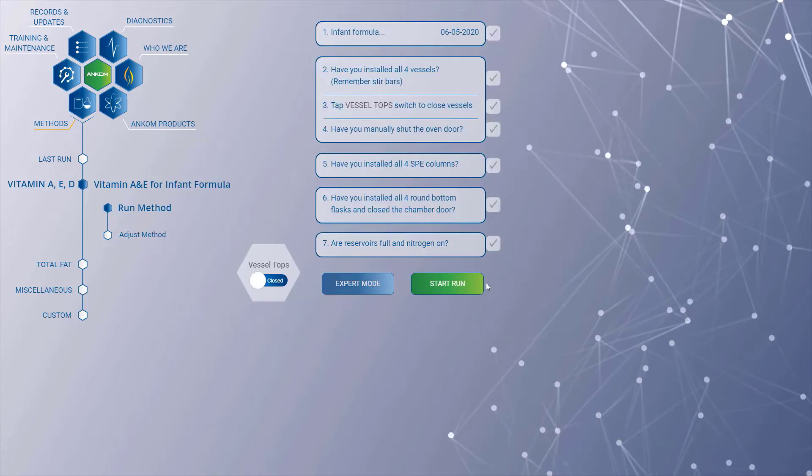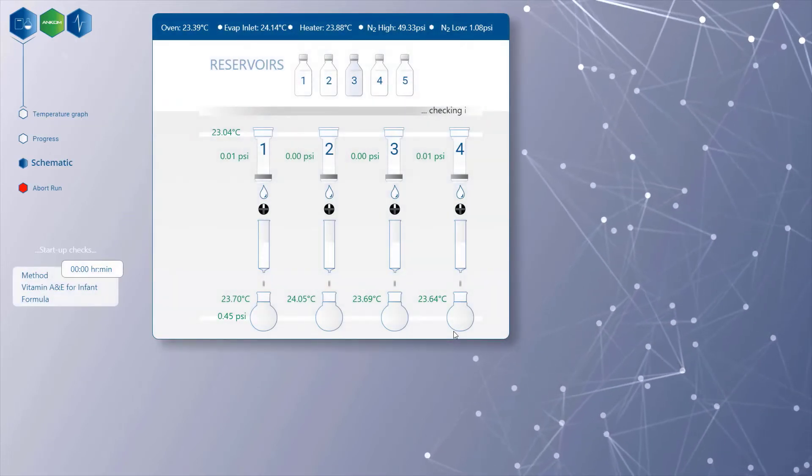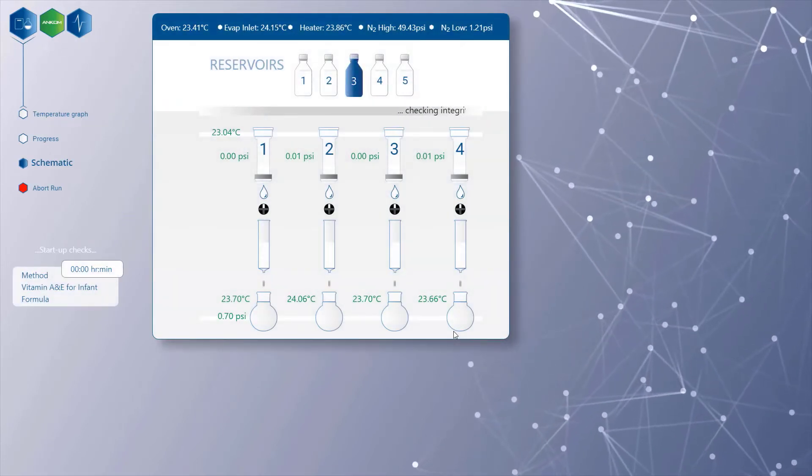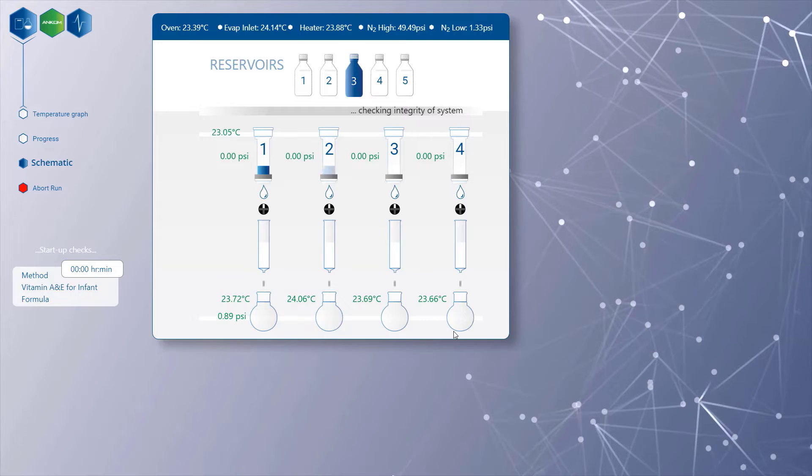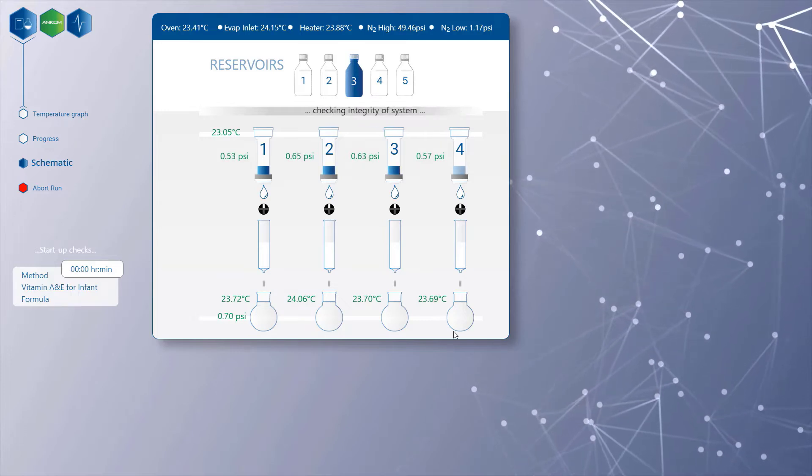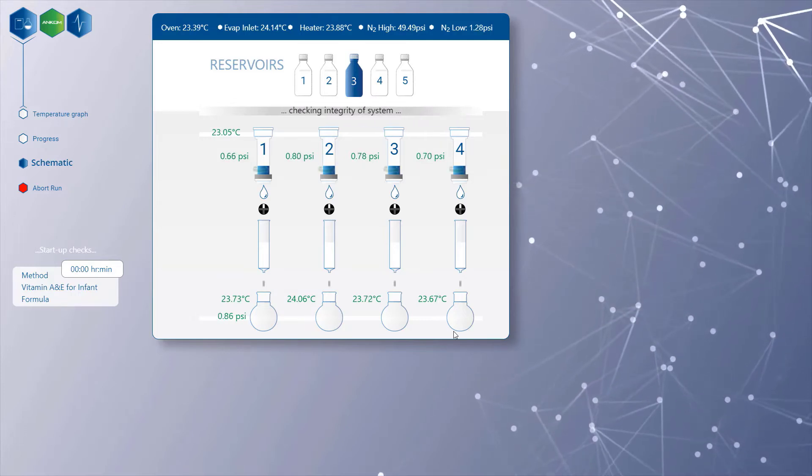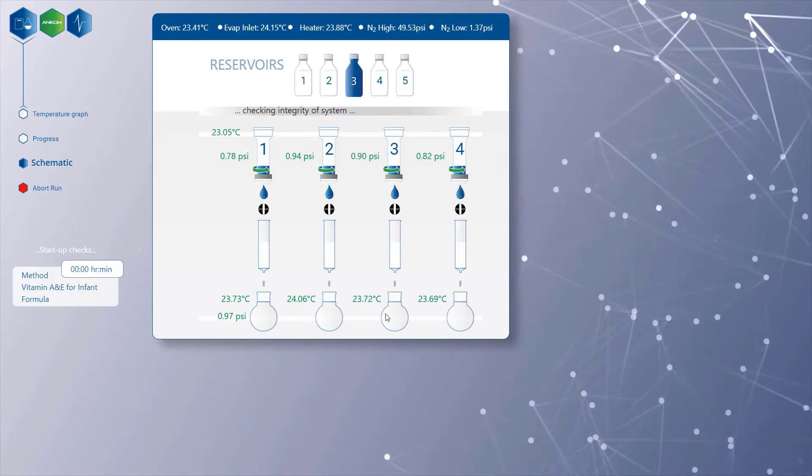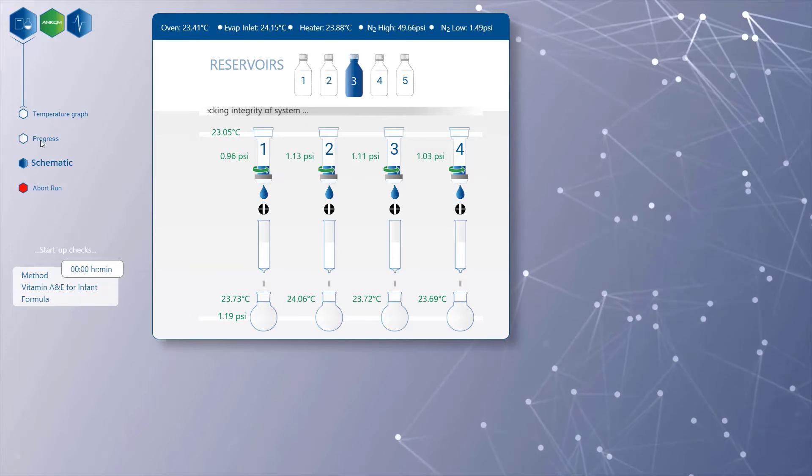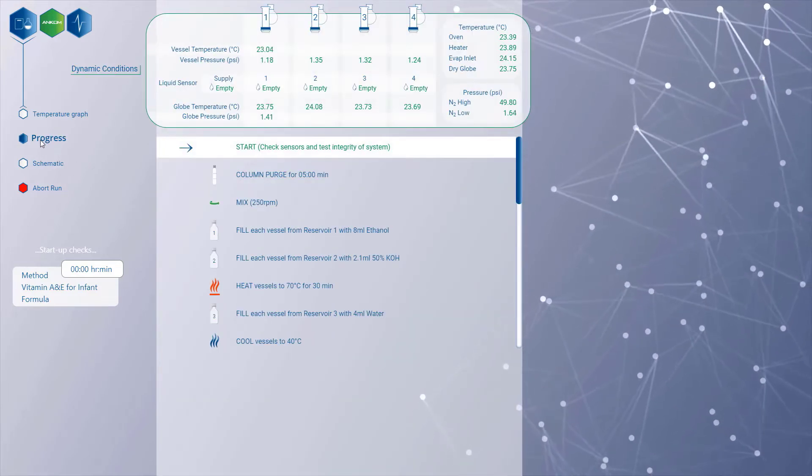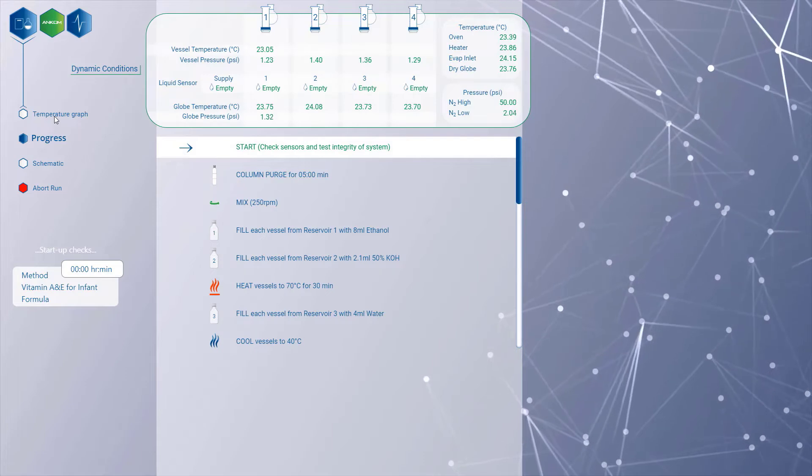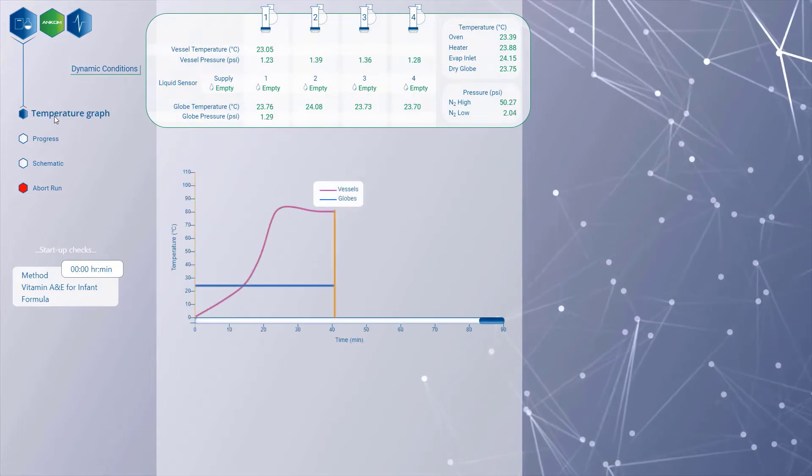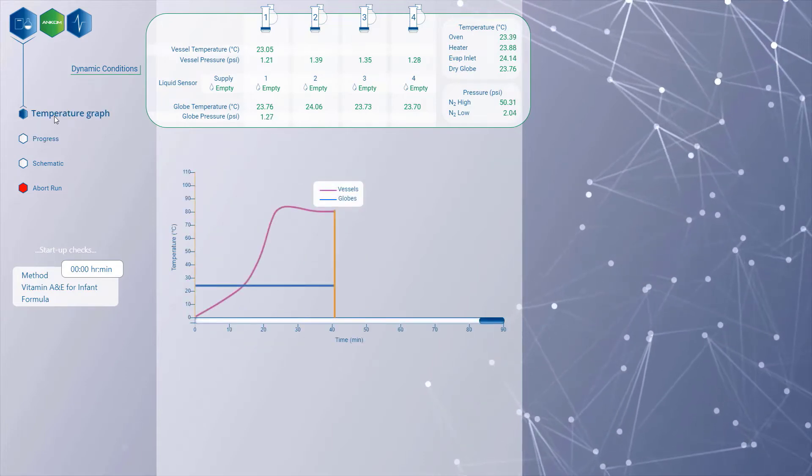During an assay, the user can track progress and dynamic conditions. The interface will show which vessels are being filled, whether draining is complete, which reservoir is engaged, and highlight the current step of the method—all in real time with up-to-date temperature and pressure data.